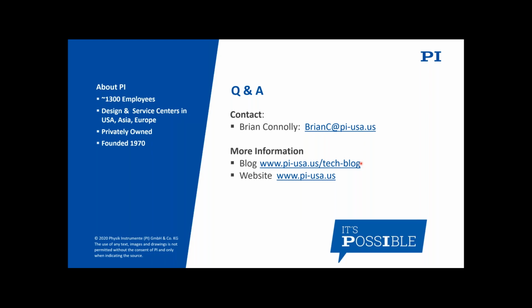I had one other question for Brian about vacuum performance. How do the piezo stacks react in vacuum? Is there any outgassing or heating to worry about? It's definitely an application we take care of. We work with a lot of national labs, so we've done a lot of vacuum work.